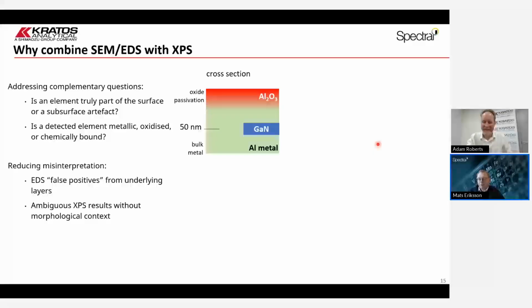Yes, right, and I think this, in a way, is a good cue for the connection to Uppsala and Kai Siegbahn, who got the Nobel Prize for initially developing the technique, right? Yes, electron spectroscopy for chemical analysis, ESCA, which has largely fallen out of favor as the acronym.